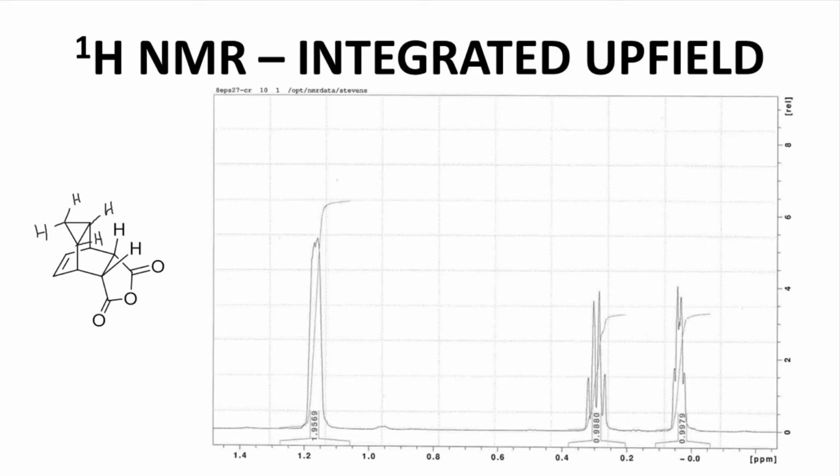In this case, the two hydrogens are not magnetically equivalent. They have different electronic environments and therefore have different chemical shifts. One is at about 0.3 ppm and the other is at about 0 ppm. Both are some form of a quartet. With a clean NMR spectrum, a single spot TLC, and a sharp, reasonable melting point, the product looks good. Let's determine the yield.